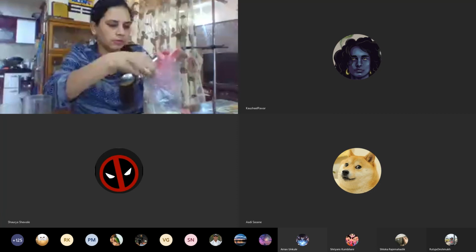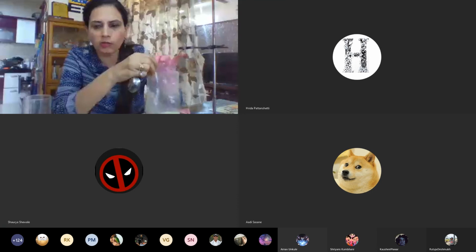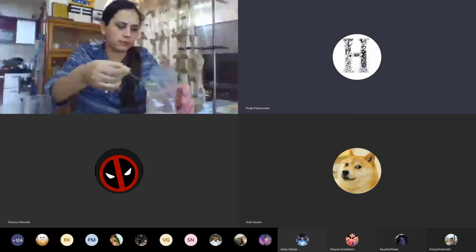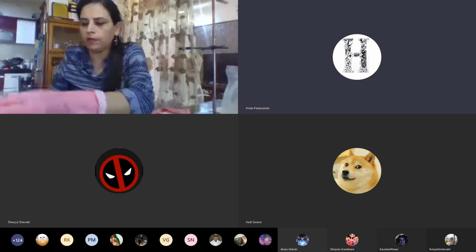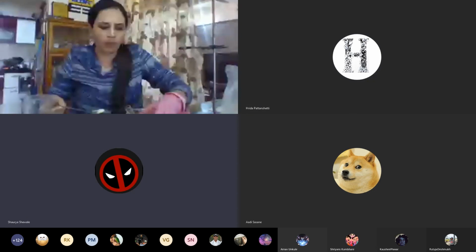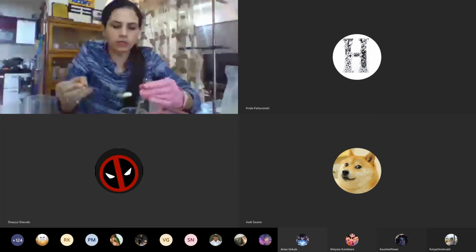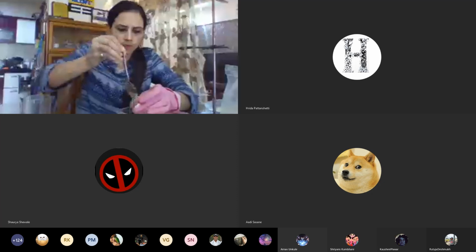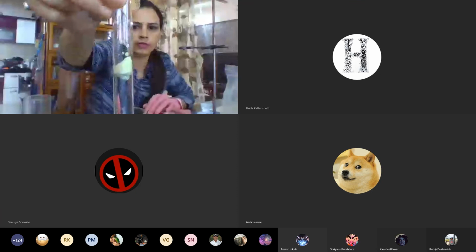After writing sulfur dioxide, we have to show an arrow up. Yes, you have to show the arrow because gases always go up. And do we have to write heat after the arrow? Yes, you have to write it because you are heating sulfur. The sign for heat in chemistry is a triangle, right? Yes, triangle is the sign for heat. So I'm going to add sulfur here. Okay, let me show you the test tube.